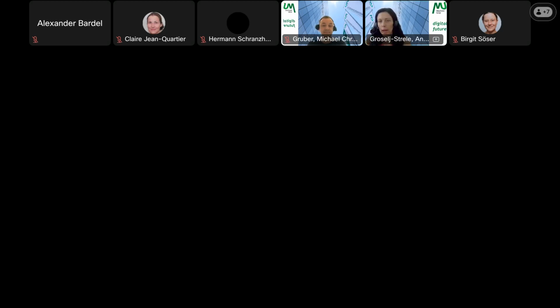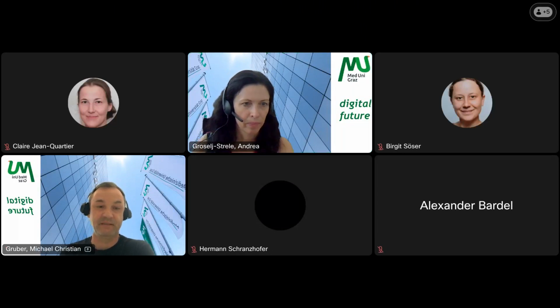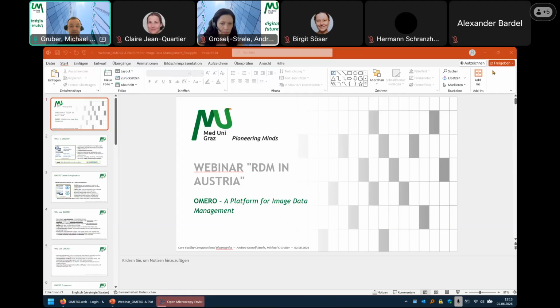And now I want to hand over to Michael Gruber. He is our expert for OMERO. Michi. Thank you, Andrea, for this kind introduction. My name is Michael Gruber, and I'm working on the topic of OMERO for the last 1.5 years.